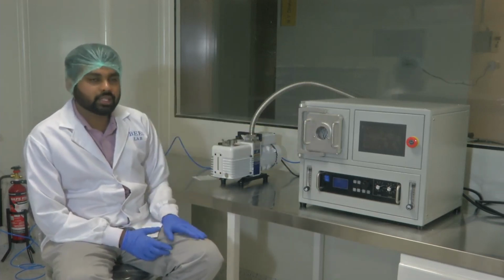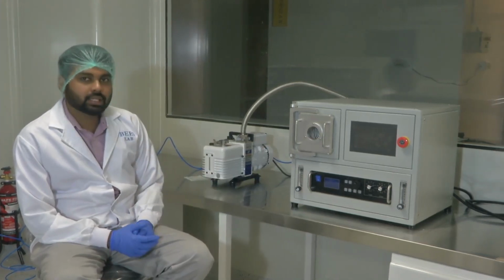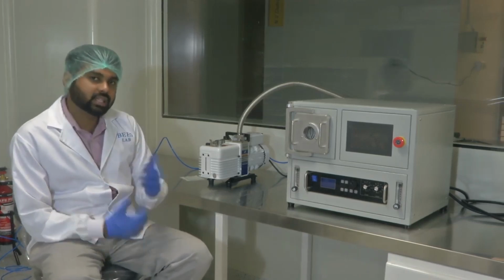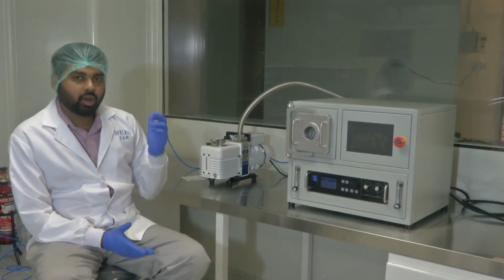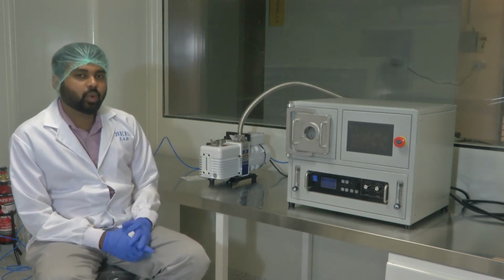Okay, this, as you know, is oxygen plasma. But what is plasma? Plasma is any gaseous substance. It can be the air which has all its constituents, nitrogen, oxygen, argon and all, or a particular gas, let's say oxygen in this case. Oxygen that is in the plasma state. So what is the plasma state?